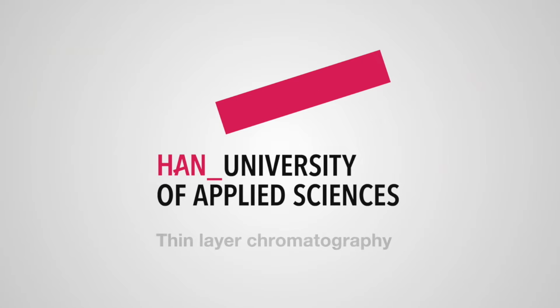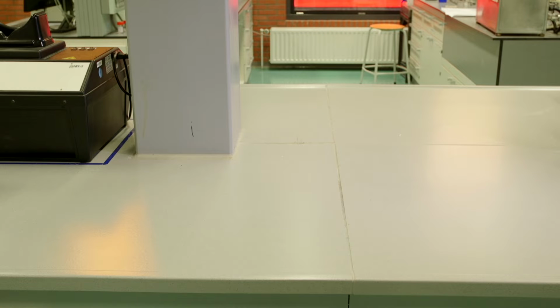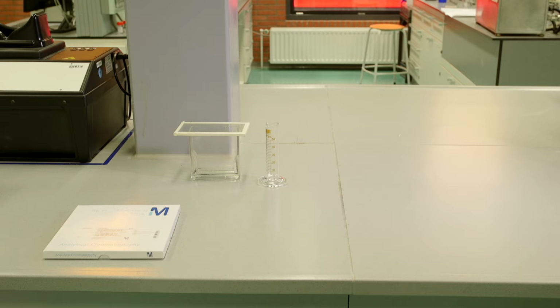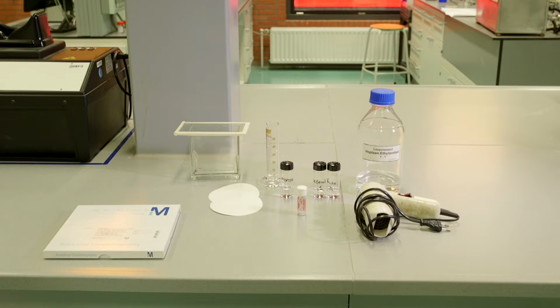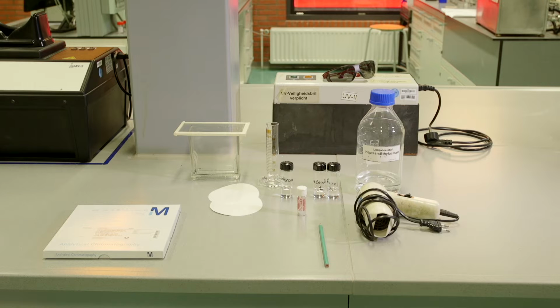To perform thin layer chromatography, TLC, you need the following materials: development tank or TLC tray with a lid, a measuring cylinder, TLC plate, capillary pipette or micropipette, filter paper, hairdryer, mobile phase, the sample to be analysed, a reference solution, UV lamp, pencil, sand, scissors, tweezers.